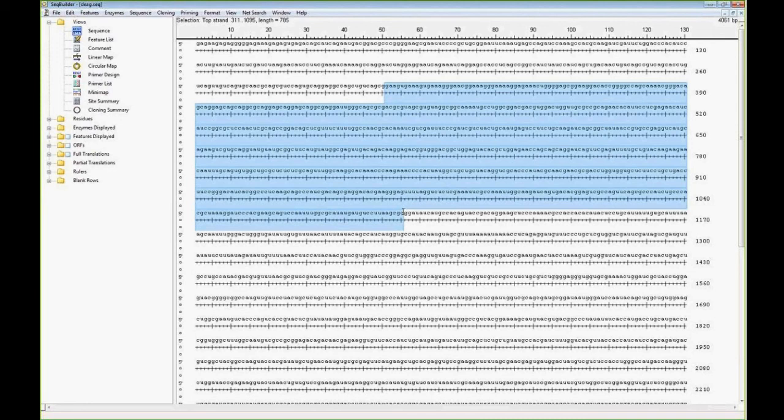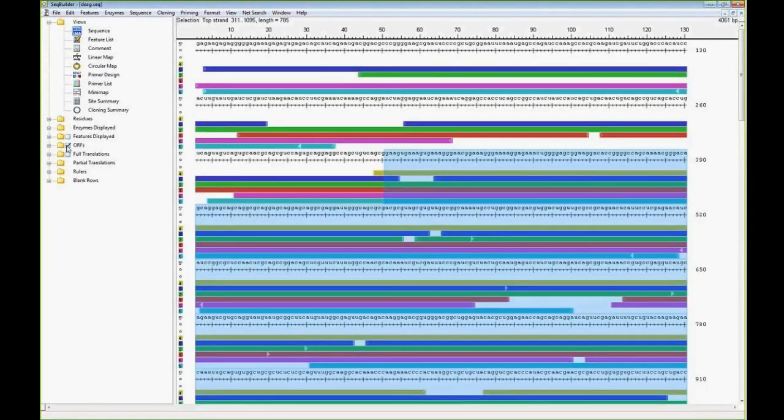Another option is you can apply different open reading frame filters. On the left-hand side under the views, there is an open reading frame view where you can toggle between top strand and bottom strand. This allows you to take into consideration the frame, the presence of initiating methionines, transcription stops, open reading frame size, and so forth.